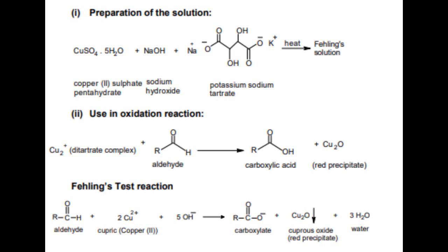3. Schiff's test. Fuchsin hydrochloride has quinonoid structure as shown in the margin.